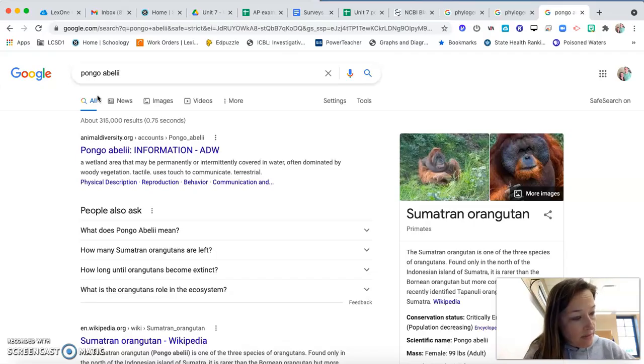And that's how you would make a cladogram. If you wanted to make a phylogenetic tree, you would take the one that comes off first, or has the least similarities. That's the orangutan. And then you'd have the gorilla. And then you would have the bonobo. And then kind of coming off, whoa, that's an ugly line. Coming off together there, you would have the chimp and the human.